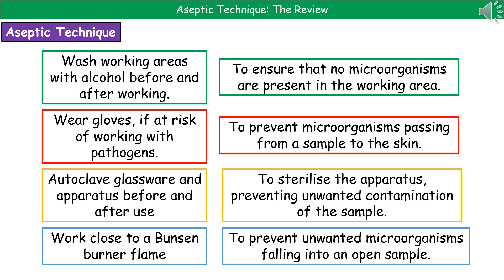Secondly, wearing gloves — the idea behind this is to prevent microorganisms passing from a sample onto the skin. Thirdly, we will autoclave glassware and apparatus before and after use. The idea behind that is it's going to sterilize our apparatus and prevent any contamination of our sample.